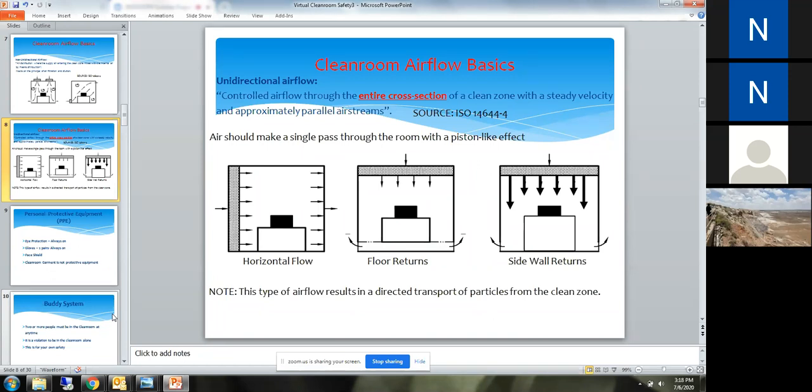What is the difference between the regular pencil and the mechanical pencil? Is there any difference to use inside the clean room? There's no difference in the sense that no pencils are allowed in the clean room. You cannot have pencils or markers.